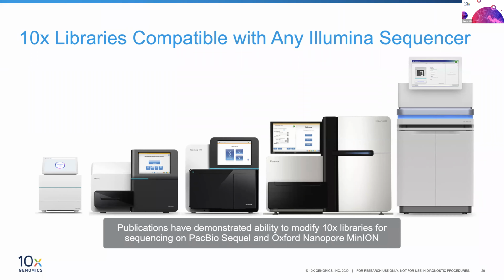On the flip side, I've seen groups that have already generated tons of single cell data and are trying to refine the spot cluster information with that data, or they've also attempted reconstructing, or putting 3-dimensional form to, single cell data in silico. So they're taking potentially canonical markers for certain regions within a particular section of tissue, and then reverse applying that to the single cell data to try to build inference maps, 3D maps spatially, out of that data.